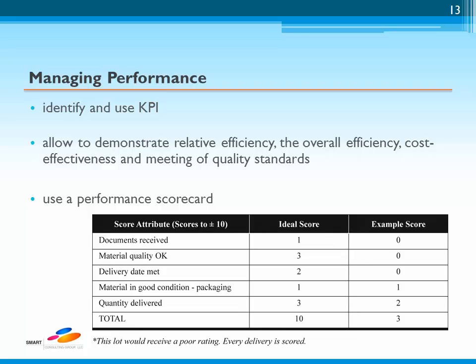This is a lot to cover. Implementing a lean laboratory is not an easy task, and many principles discussed earlier are very important to consider as you define your process operation. Through the implementation of these ideas, the new lean laboratory will be very quickly realized, and this will yield better resource utilization, resulting in improved competitiveness directly and indirectly.